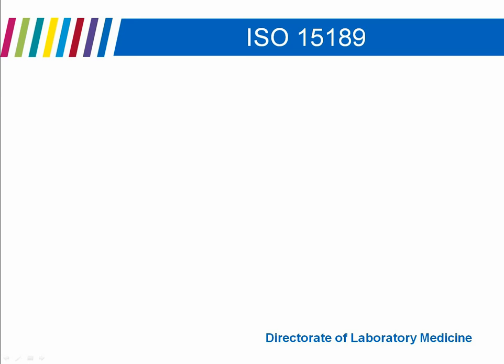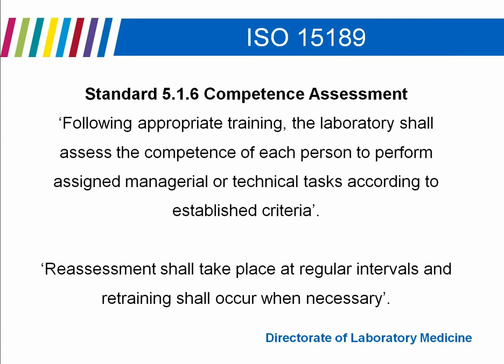So this is standard 516 in its entirety, and it states, following appropriate training, the laboratory shall assess the competence of each person to perform assigned managerial or technical tasks according to established criteria. And we heard this morning David Hughes talking about the EQA aspects of what is a managerial and technical task.